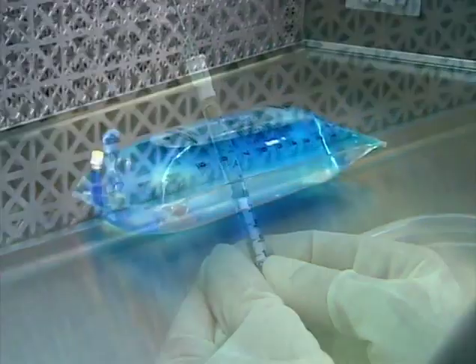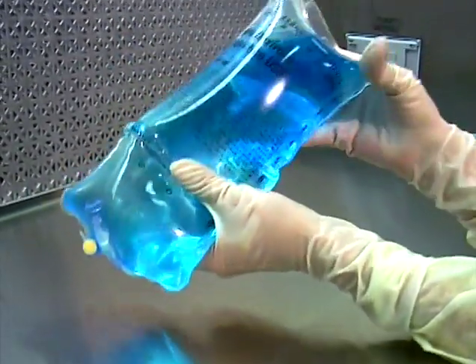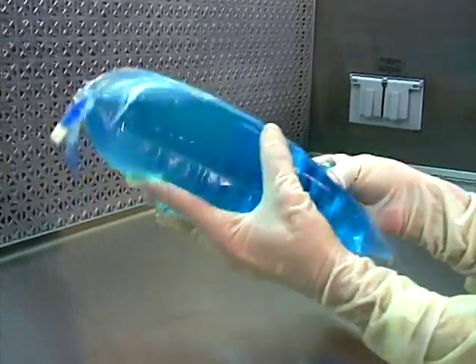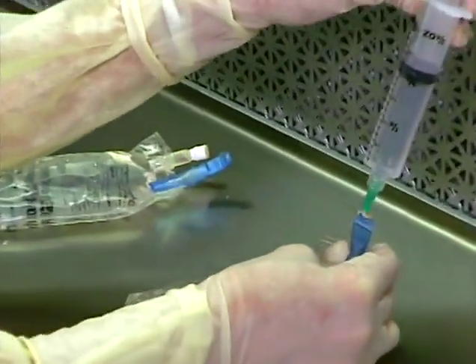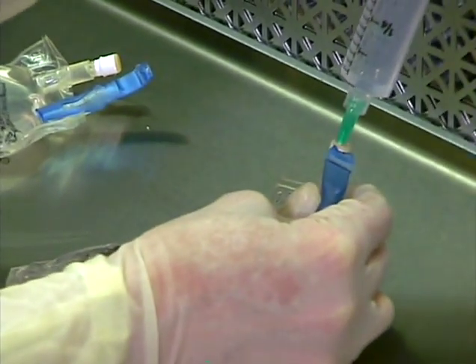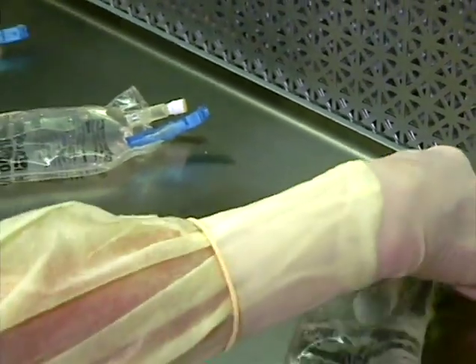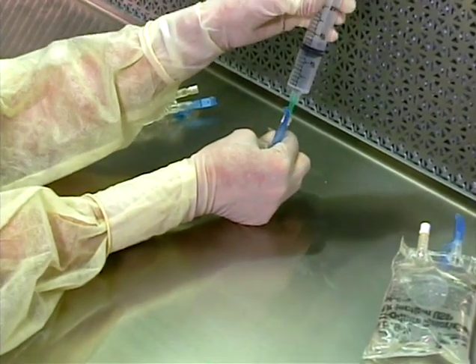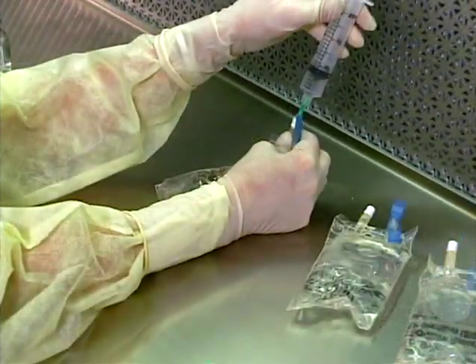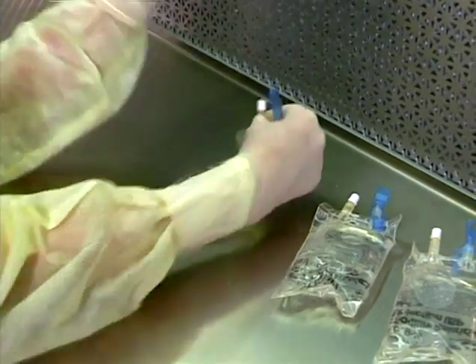Mix well after each addition, both to ensure uniformity of the drug in the container and to prevent any interactions that might occur between additives if they are mixed in concentrated amounts. It is useful to arrange all bags or bottles to be used in a specific orientation at the start of operations, for example with the additive port facing to the right, and turn or move each one in an exact way after additives have been injected, so that you can always tell which bags have been completed. It is not recommended that more than 4 bags with identical orders be staged at one time. All bags must be for identical orders to avoid errors.